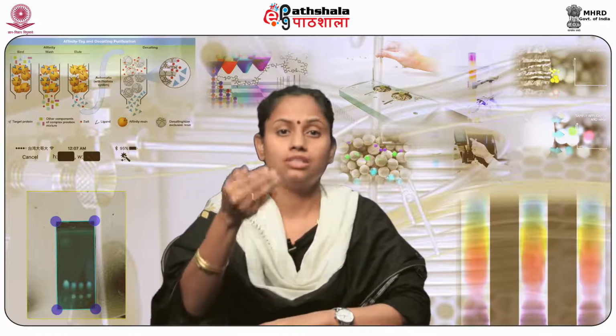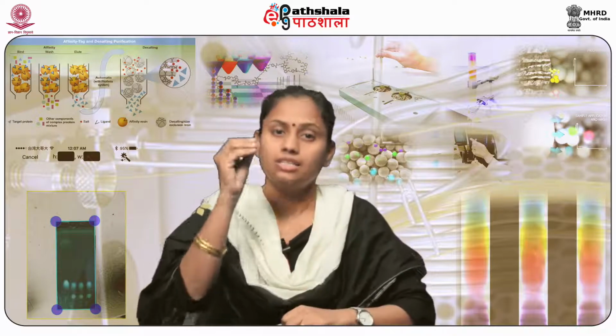In this phase, that is the stationary phase, the substance that is to be separated is selectively adsorbed. The mobile phase can be a liquid or a gas depending on the type of chromatography that we select, and it passes through the stationary phase and contains the mixture of compounds which are to be purified or separated.